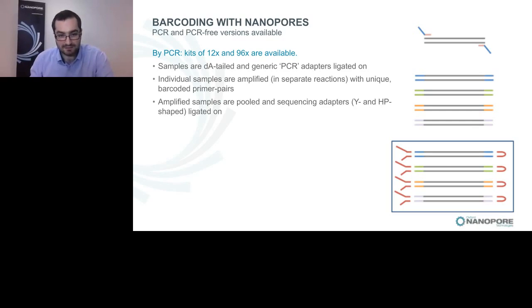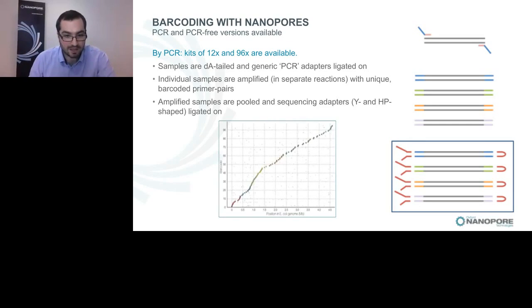So to demonstrate the efficacy of this larger set of barcodes, we designed PCR primers to 96 different regions of E. coli, and we attached a different barcode to each amplicon. So following barcode deconvolution, each set of reads was aligned to the reference genome, and the coordinates of hits were plotted in Spotfire for each barcode. The size of the plotted circle represents the percentage of reads at each position. And the 96 barcodes segregated cleanly, with 90% of the reads having a barcode identified, and about 98.8% of the reads had the correct barcode.